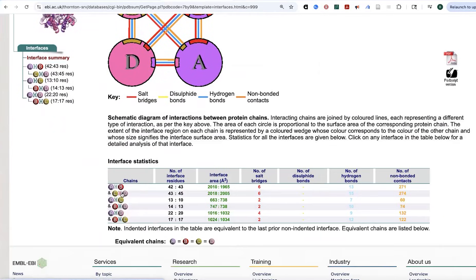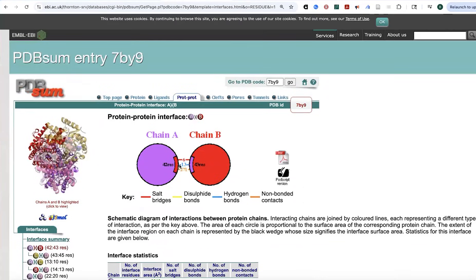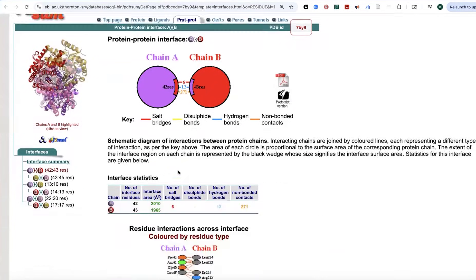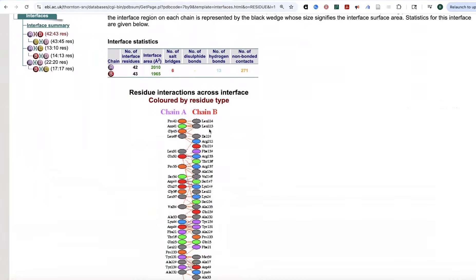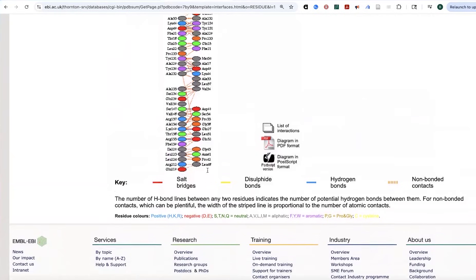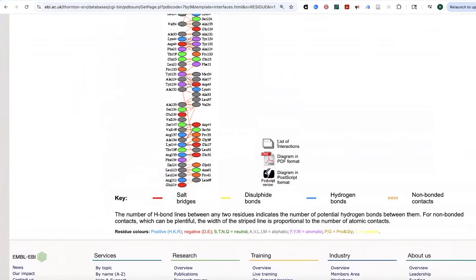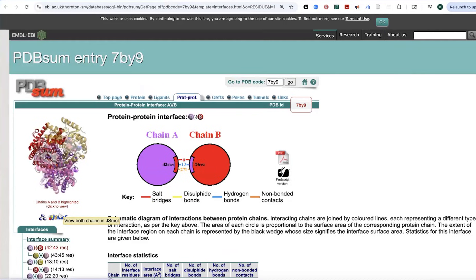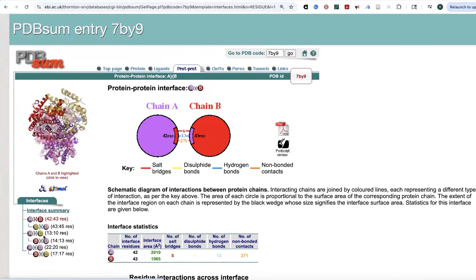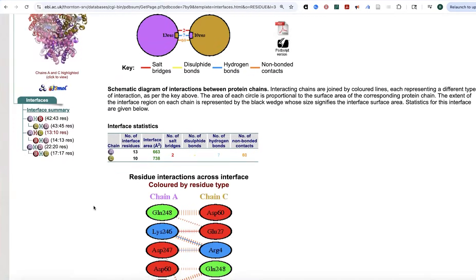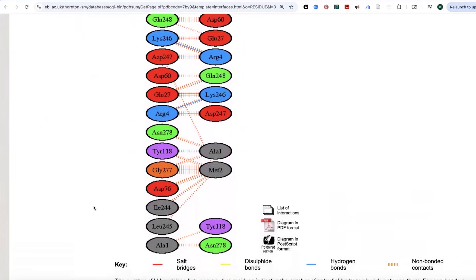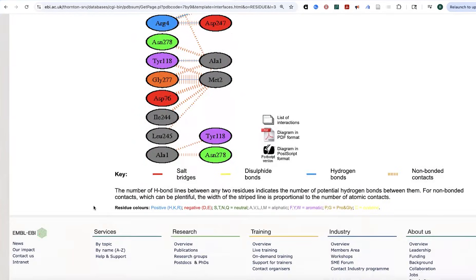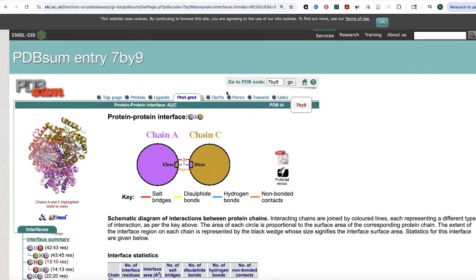But the interfaces are going to be different, and so if we click on one of these interfaces, now we'll get more information. We see the types of different bonds, and we can actually see the residue-to-residue contacts. And we can get a list if we wanted a list, just like we did before. We could get a PDF if we wanted a PDF. And then we could go and we could look at these different interfaces and see maybe which ones of these look stronger or weaker, and the different types of bonds between them.